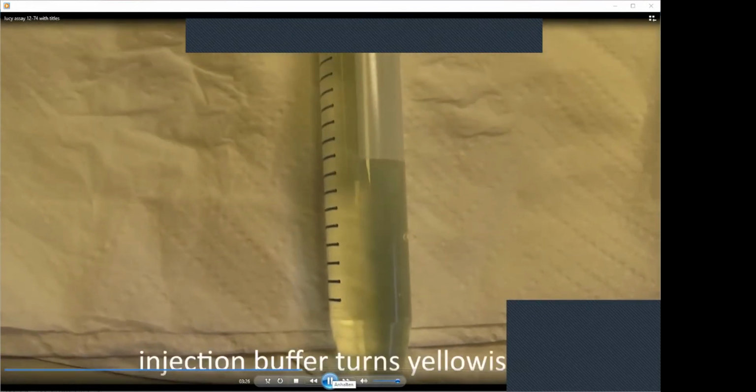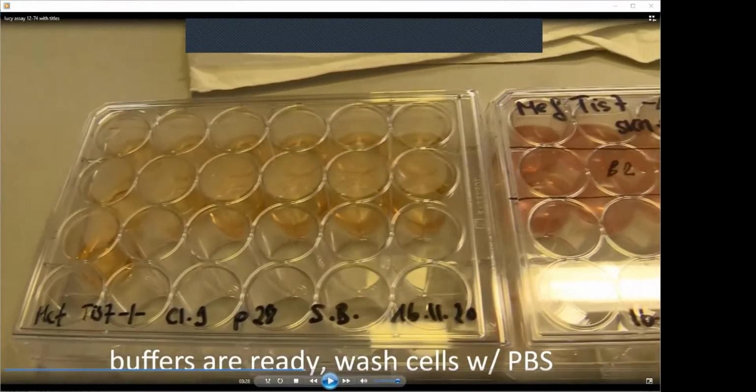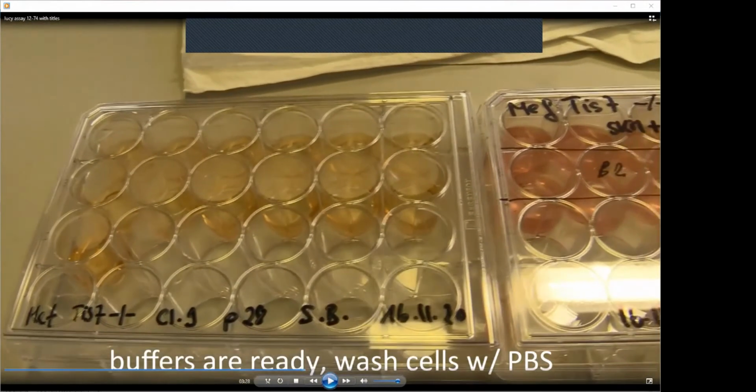And you can notice that it changes color to slightly yellowish. Then the next step, once you have prepared these buffers, is to get rid of the medium which you have in the wells of your dishes, and then wash cells with ice cold PBS. This is an important step because this medium would interfere with the reaction.